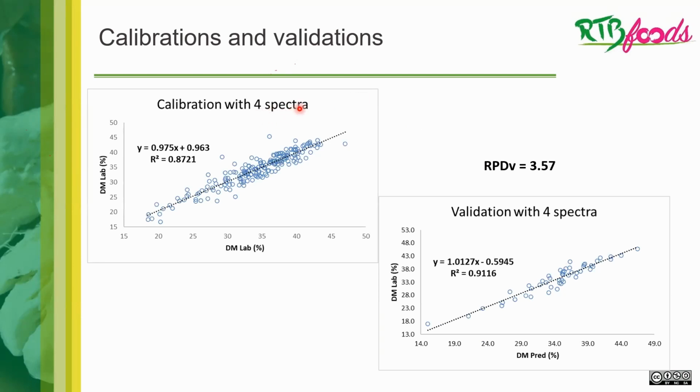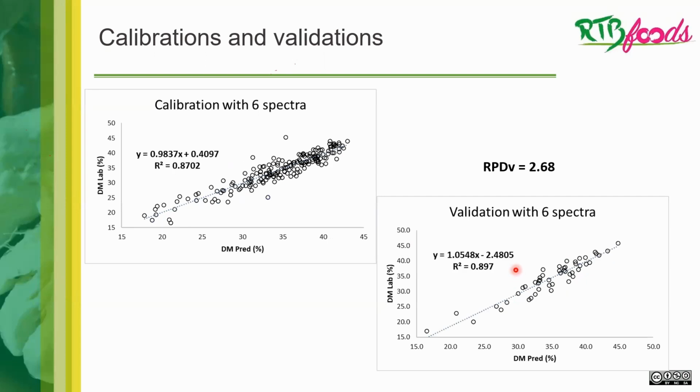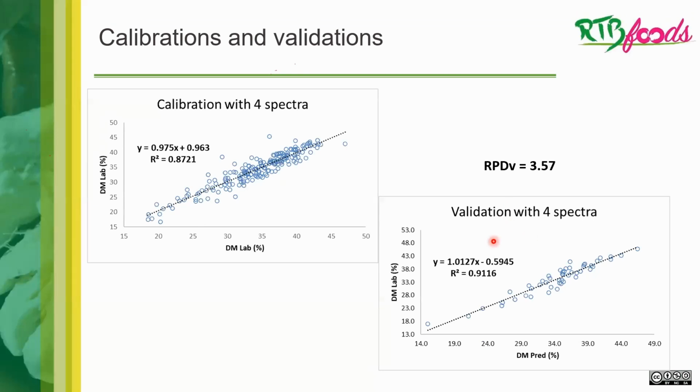For validation with four spectra, I was expecting a slightly worse result, but I don't know if it's the randomness of the samples for validation. In the calibration we obtained a good slope close to one and a good correlation close to 0.9, but in the validation it was better than in the calibration. In the future we need to check more equations, or obtain another group for external validation. I think we need to check this, but this is very good. If we only need four spectra, it is much better.